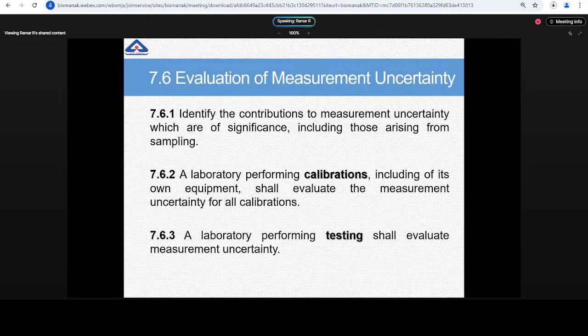Mostly people are working with spectrophotometers and other chromatographic techniques, and they call it instrument calibration. Actually, they are not calibrating the instrument, they are only verifying it. People may call it an internal calibration of a GC or of an LC. Don't say it's an internal calibration. What you are doing is not calibration. That is performance verification. Simply say it's a performance verification or an intermediate check.